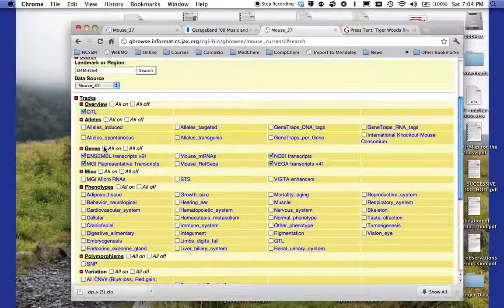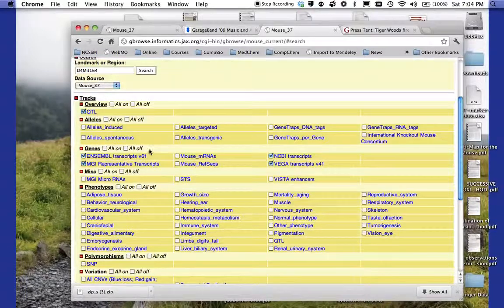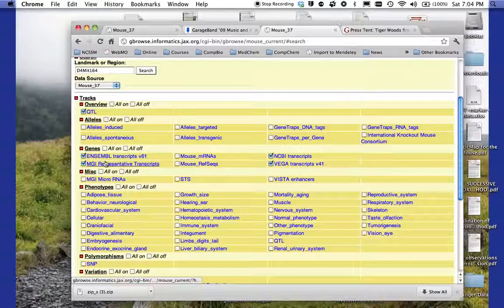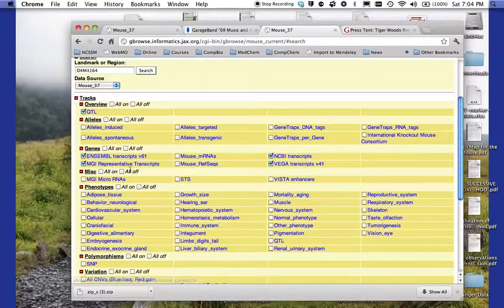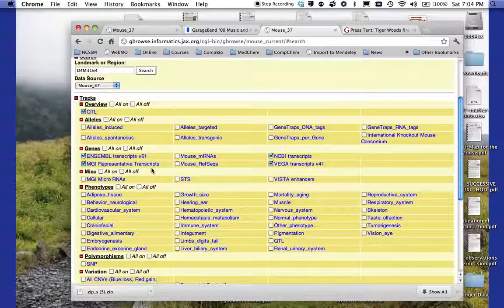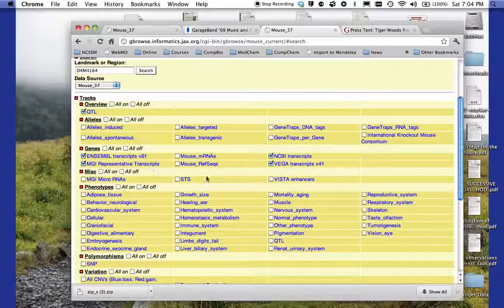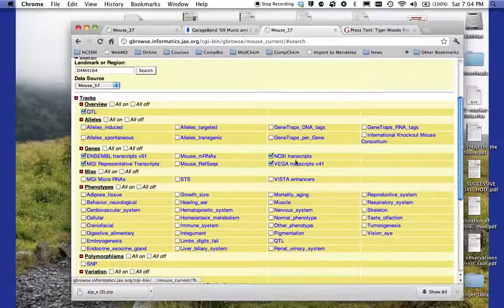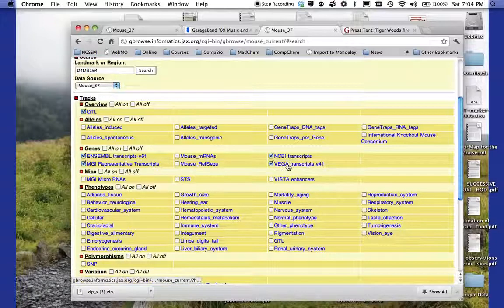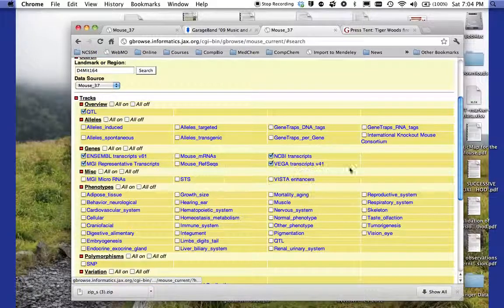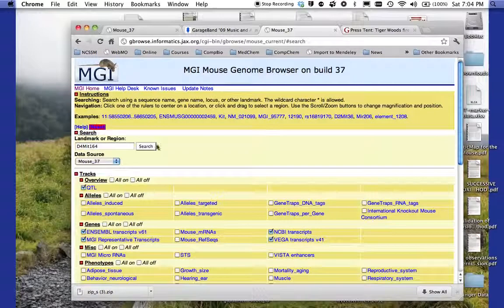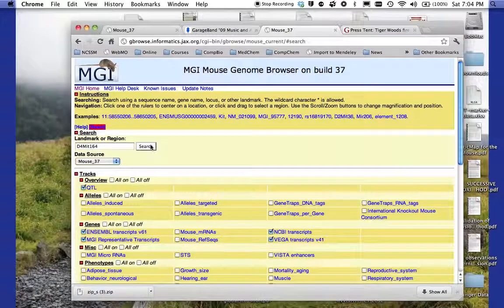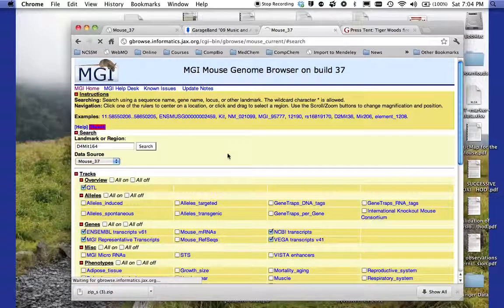Mostly what I want to look for is genes. And typically what I would like to look for is ensemble transcripts, representative MGI transcripts, NCBI or Vega transcripts. So I have those all checked on. And once I do that, I'm going to hit the search button.